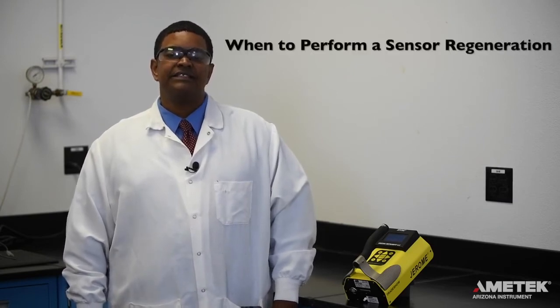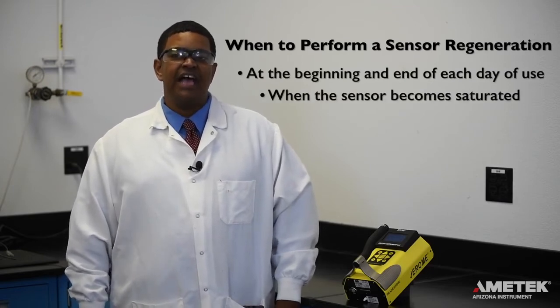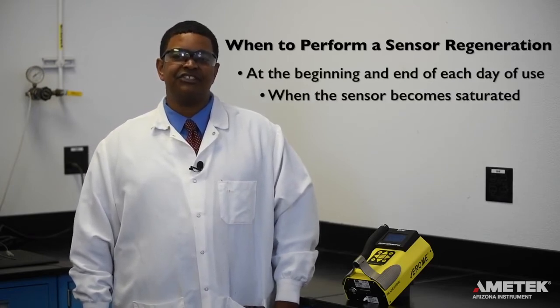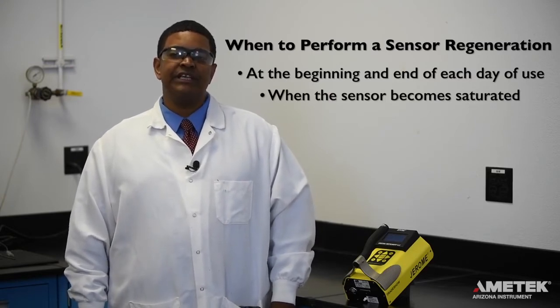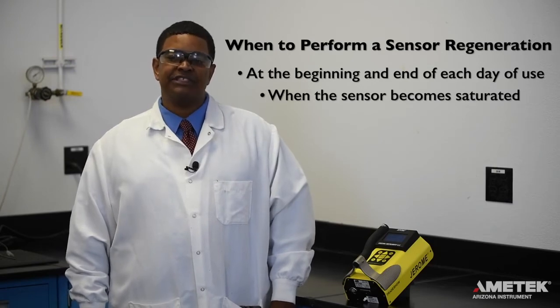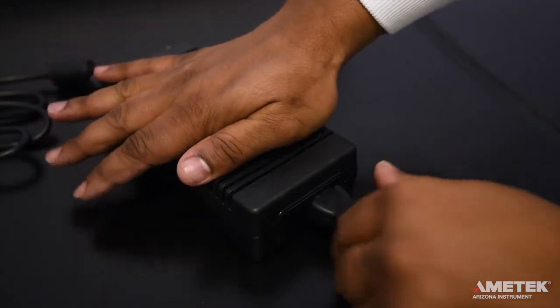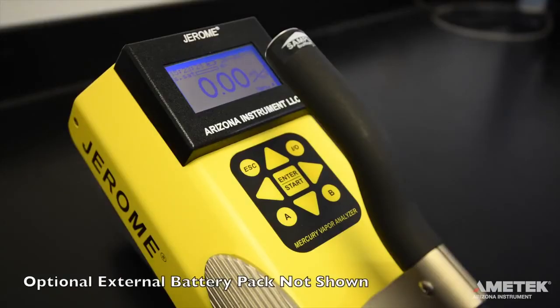Now that the instrument is on, it's time to perform a sensor regeneration. Sensor regeneration should be performed at the beginning and end of every day you are using the instrument, as well as whenever the sensor becomes saturated. Regeneration helps to reset the sensor so that it can continue to provide accurate and precise readings. To perform a regeneration cycle on the J405, plug the instrument into the line cord and AC adapter, or the optional external battery pack.